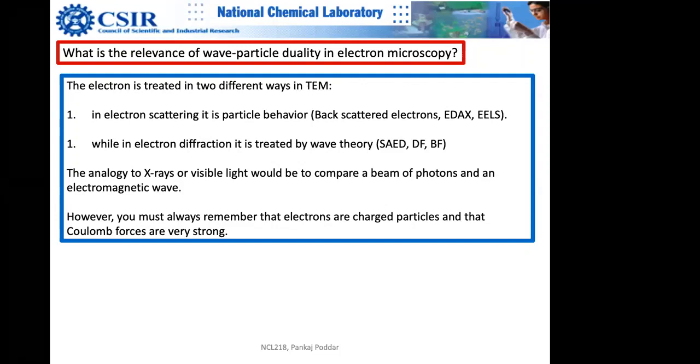And please note that when you look at the interaction of X-ray photons or other photons with matter, photons generally get absorbed by the electrons, and then they get re-emitted. The transfer of energy takes place, and these photons get largely annihilated. But in this case, there is energy transfer sometimes, inelastic scattering, or there is elastic scattering with no energy transfer. In real physics terms, there is nothing such as purely elastic scattering. There is always some energy exchange, so we call it quasi-elastic.